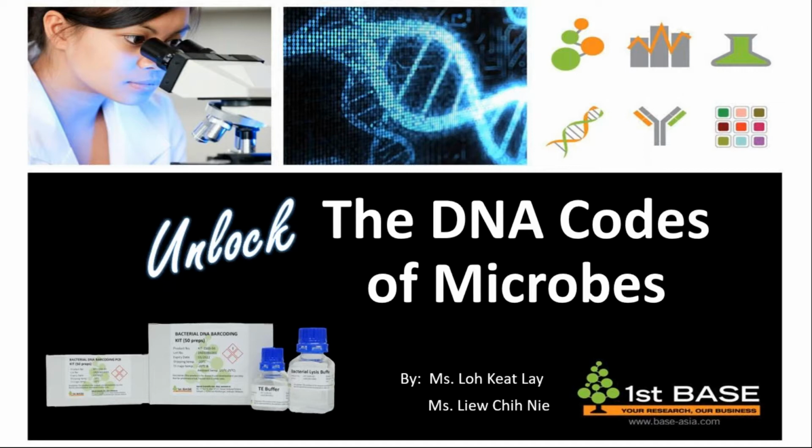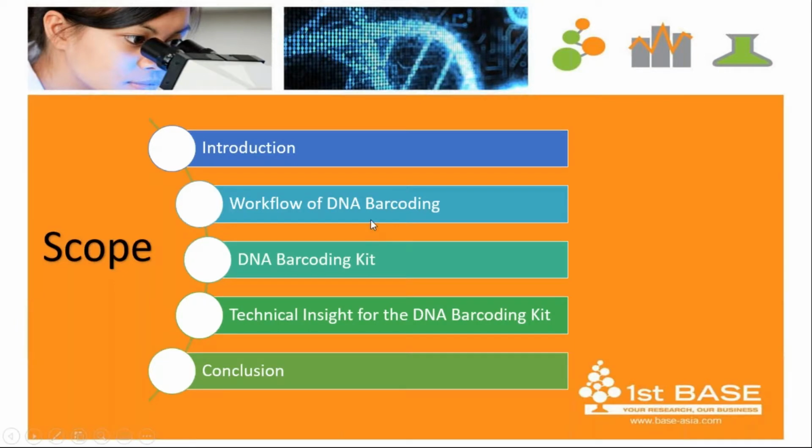Okay, so let us start with today's webinar, titled "Unlock the DNA Codes of Microbes." In this webinar, we'll go through an introduction on what DNA barcoding is, and then the basic workflow of DNA barcoding.